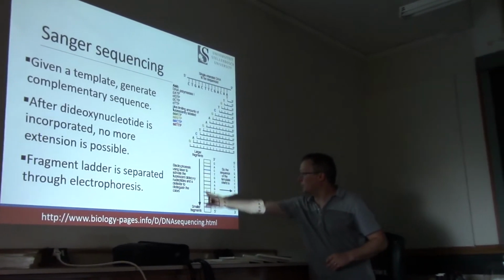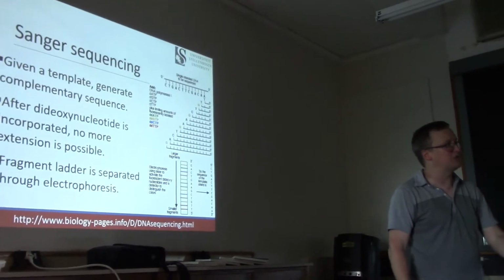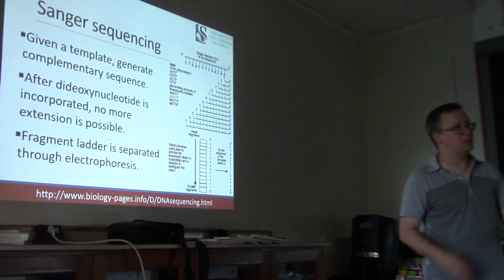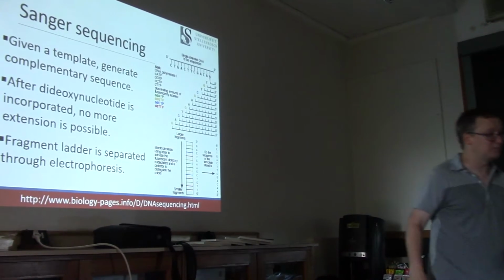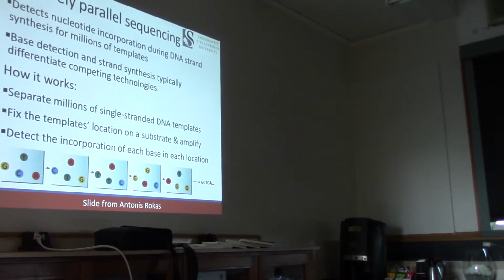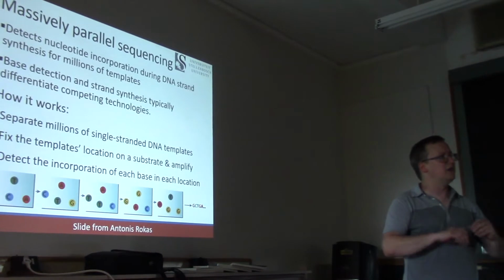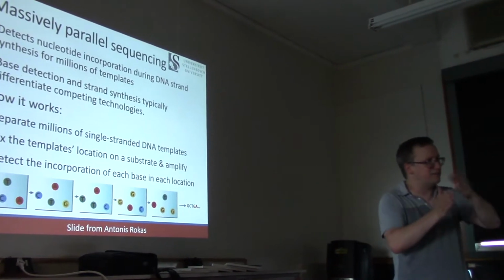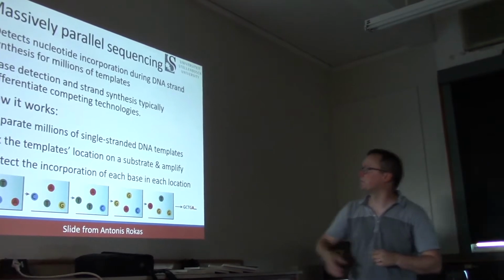We'd be able to measure, basically interrogate, which dye was incorporated in this complementary sequence and what its size is relative to all the other complementary sequences. Now, that might seem a little complex, so we're going to talk about electropherograms in a little while, that represent all of these different color traces that came back from the complementary sequences.